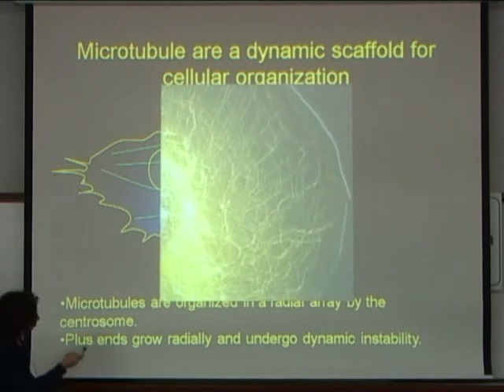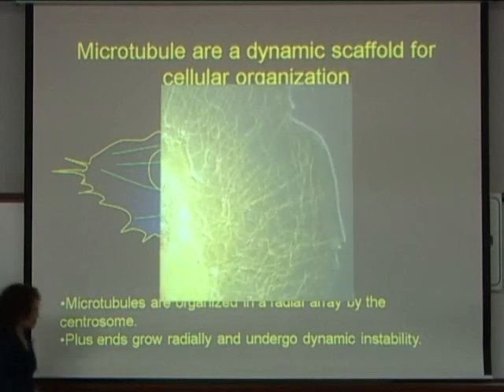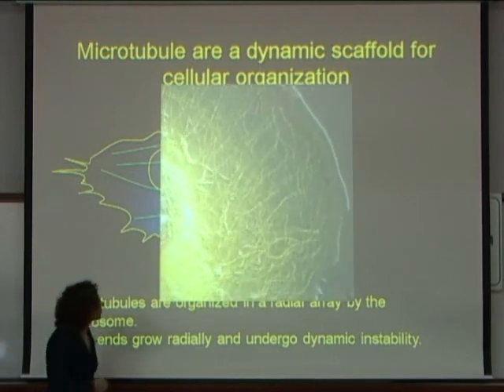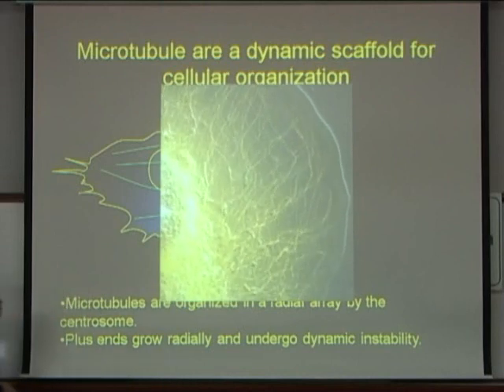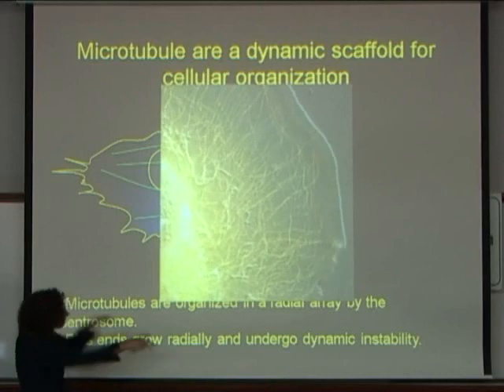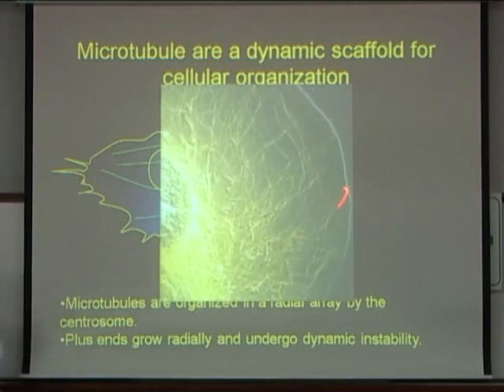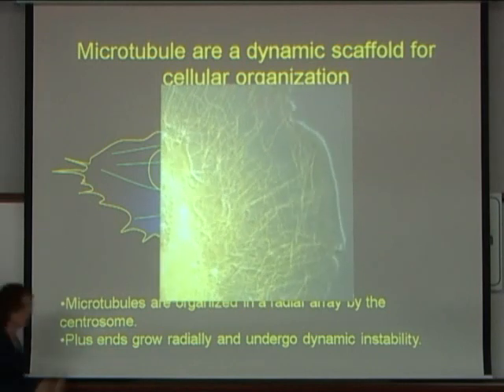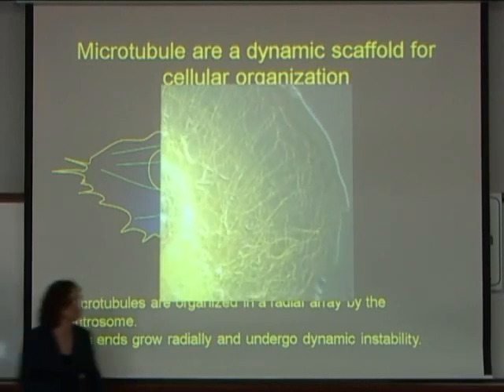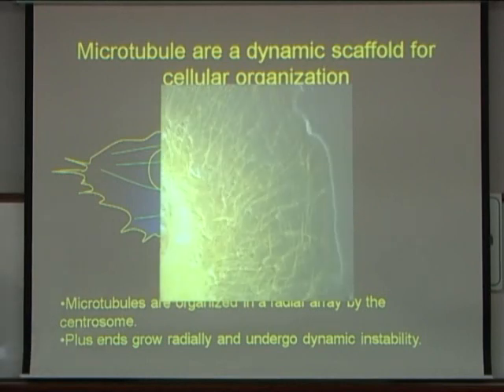So here you can see the cell dynamics by DIC microscopy, and the microtubules are fluorescently labeled. I think we color-coded them in Photoshop. They were probably red or green, but they're pretty this way. And you can see they're undergoing this growing and shortening. What does this behavior have to do with the actin cytoskeletal dynamics? It doesn't look much like the actin cytoskeleton dynamics at all.